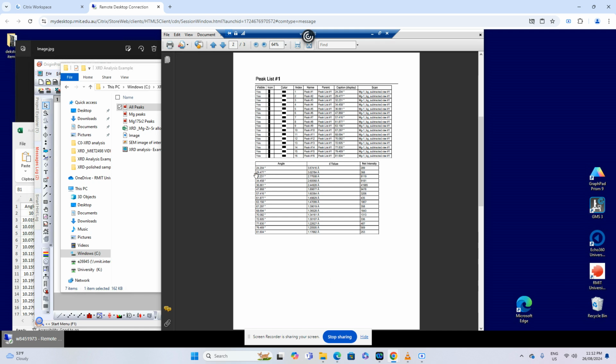So it means the peak, which is at 24.20, is coming from some compound or some phase in which the atoms have a d spacing of 0.367 nanometer. It is very useful information because if we further characterize these alloys by some other techniques like high resolution transmission electron microscopes, in that we can also use the electron microscope to do a diffraction of electron beam, and we can also obtain similar information using that machine.